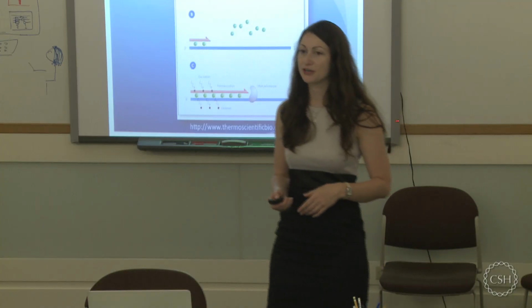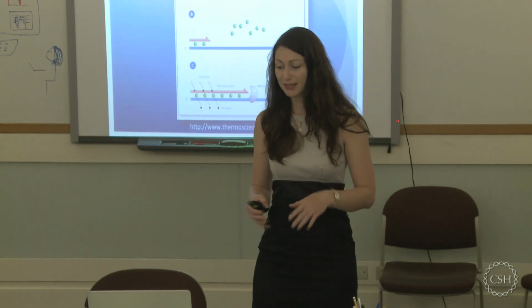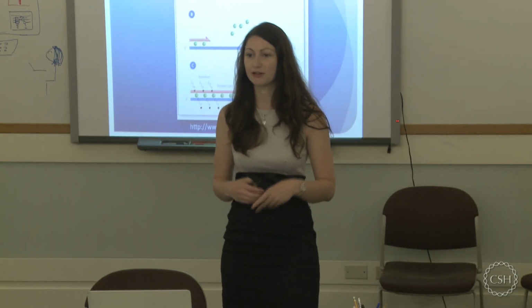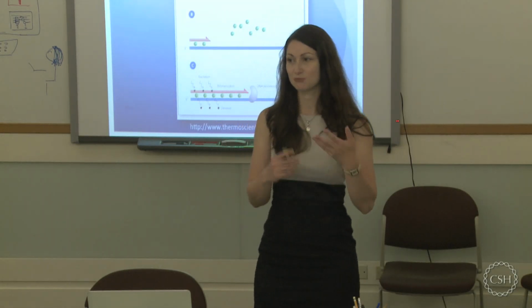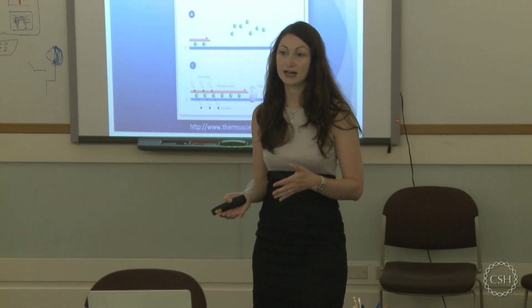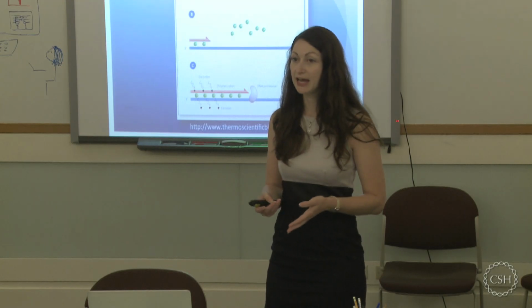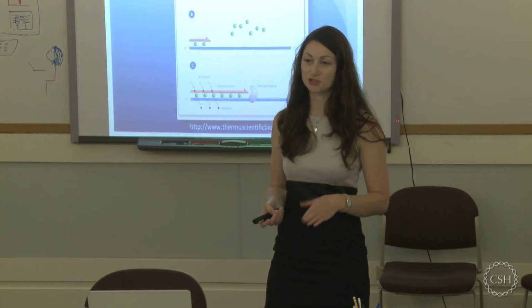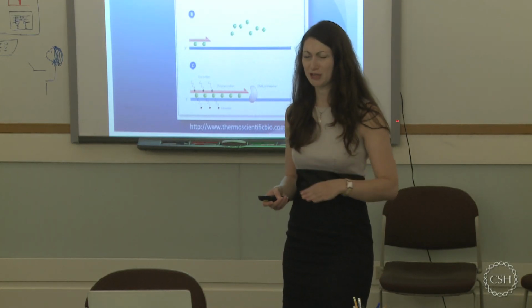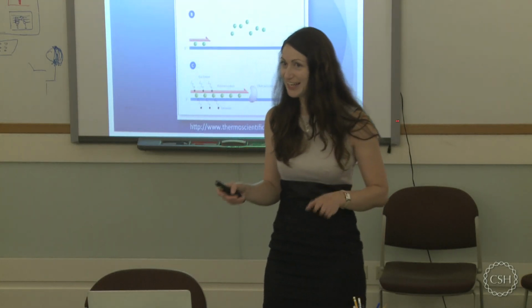There's a lot of different ways of performing qRT-PCR, and that depends on your system, on whether or not you have a Roche LightCycler or Applied Biosystems or whatever you have in your labs. They have different technologies. I guess the most commonly used, apart from SYBR Green, would be TaqMan chemistry. I will only cover SYBR Green in the interest of time, and I only know about TaqMan otherwise, so please don't ask me about molecular beacons or something like that. I don't know it.